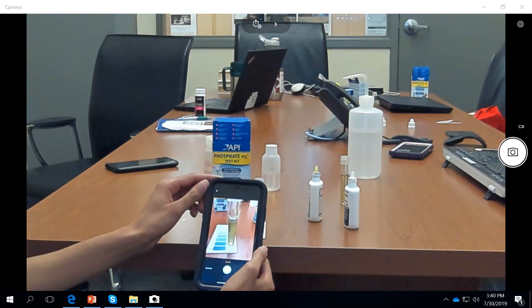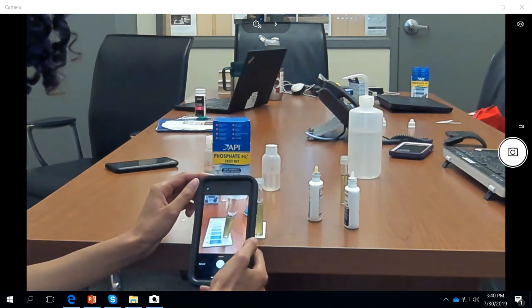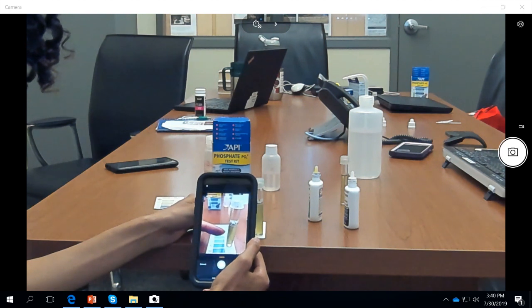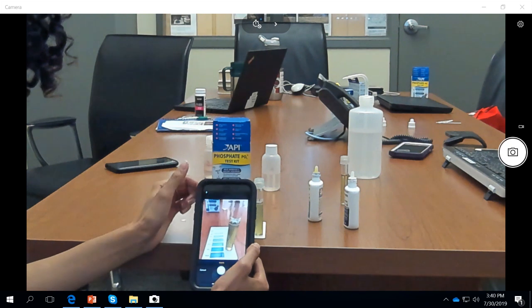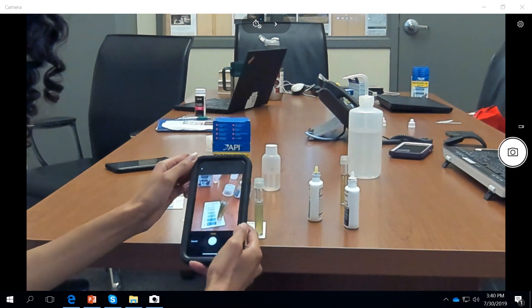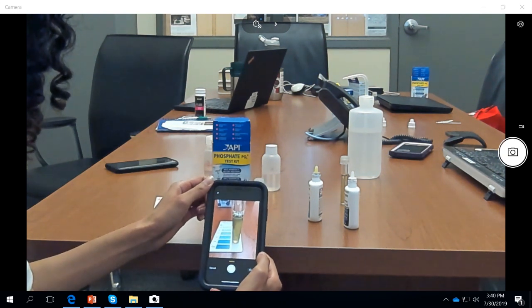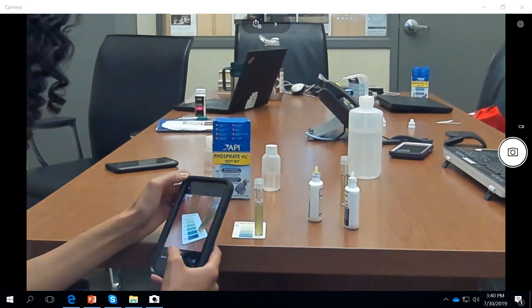So as close as possible, try and find the best lighting and angle where you're able to see 2 reflection cones within the vial. At the top, you'll see a darker color on both sides, and on the lower bottom, you should see a lighter cone where you can select the test pixel. So attempt to get as close as possible and find that inner cone that's lighter in color while also getting an accurate representation of all the reference colors. You may have to find a different angle each time.